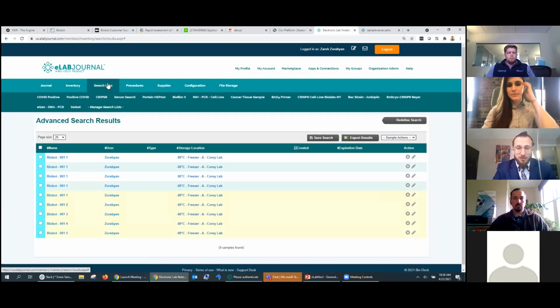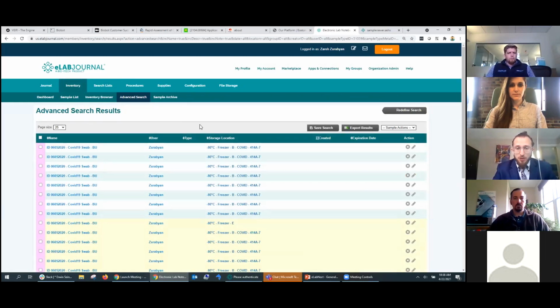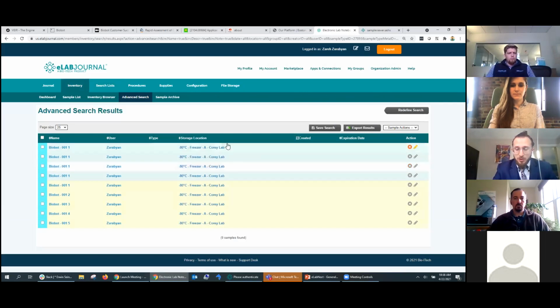Now, if I go into my search list, you see that I have a search for all of my positive COVID-19 samples, and I will see the most recent one here at the top. If I go to my BioBot search, I'll be able to get those, the most recent one here at the top.